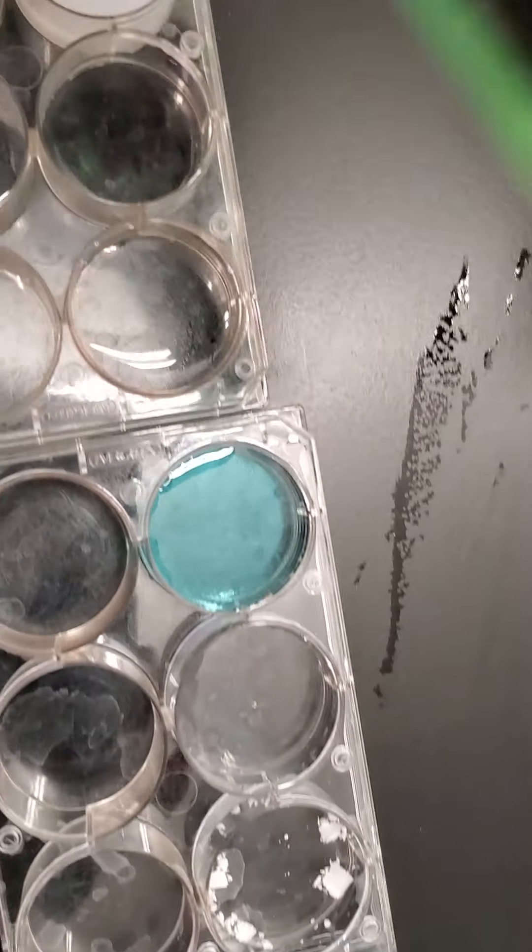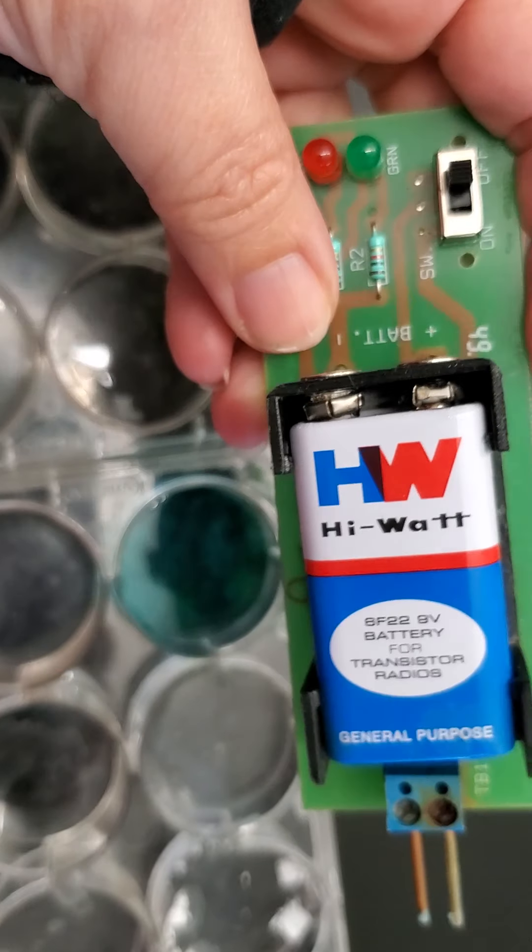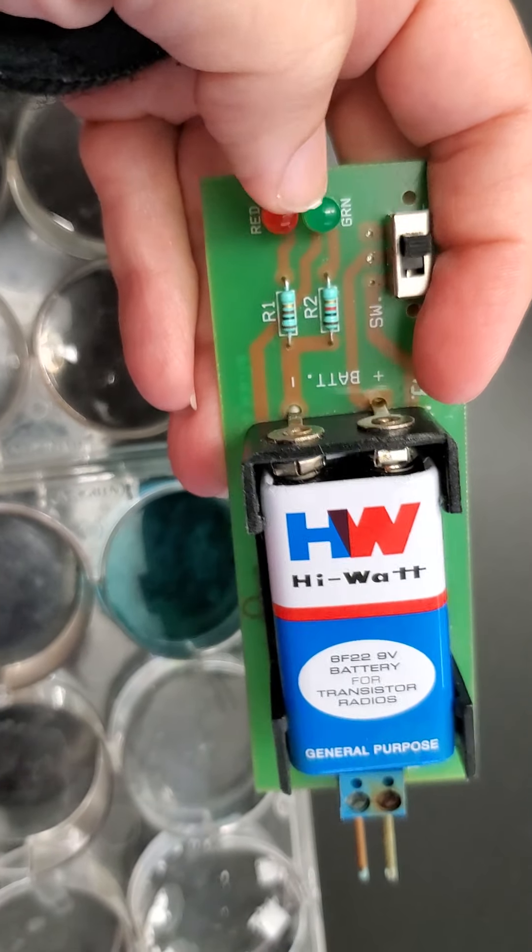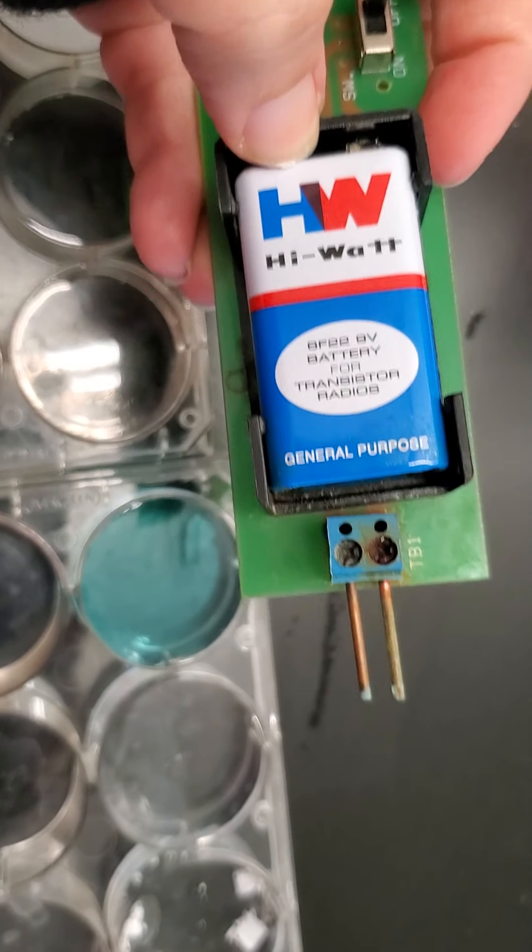I have my little conductivity tester. What it has is an on-off switch, so right now it's off. It has these two lights—a red light and a green light—and a battery, of course.